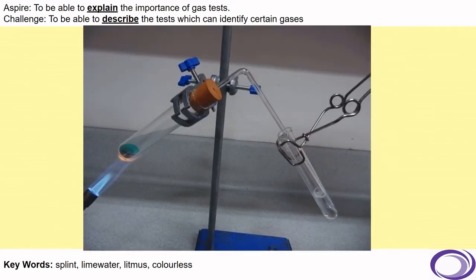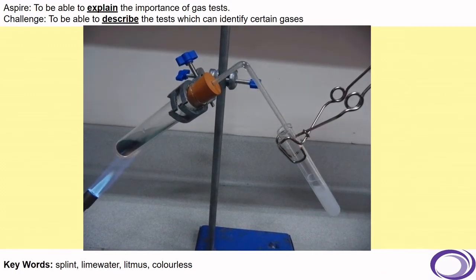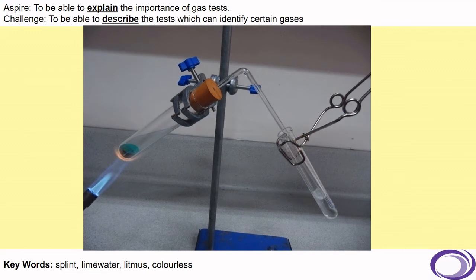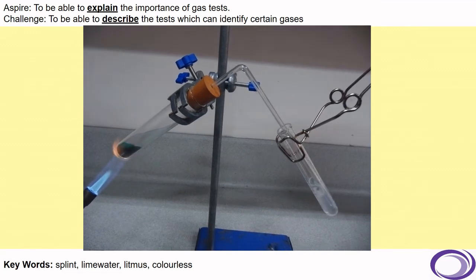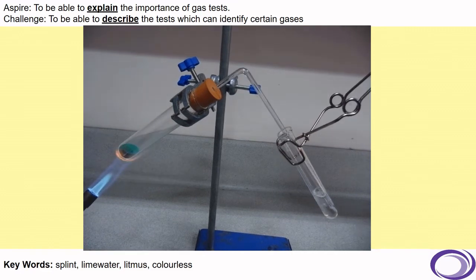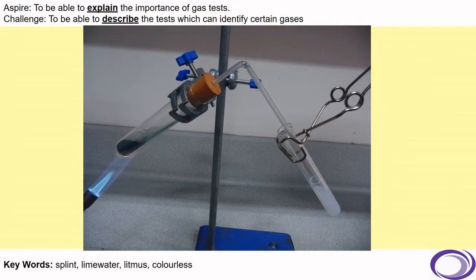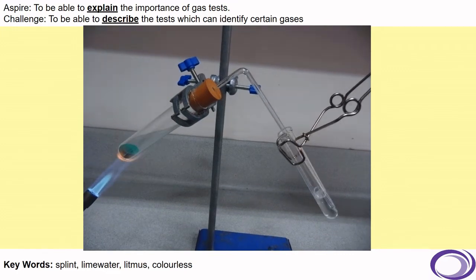So the test tube on the left with the green powder in, which is turning black, is copper carbonate, and it's giving off carbon dioxide, which is being bubbled into the test tube on the right. And you can see the colour change occurring in that right test tube. That's your lime water. So that's turning cloudy, which shows us that the gas being given off is carbon dioxide.